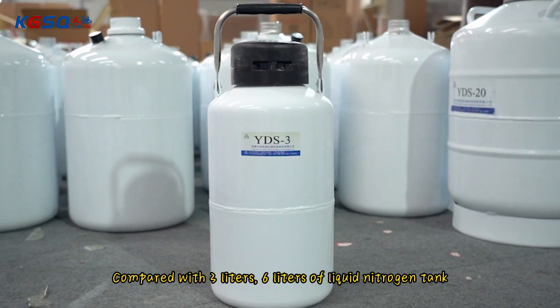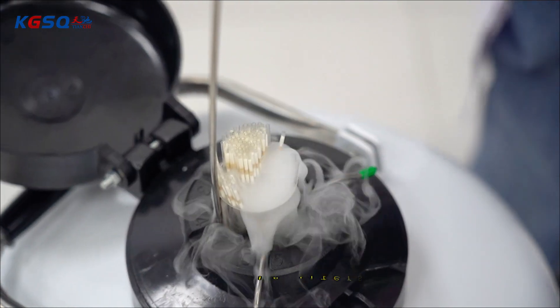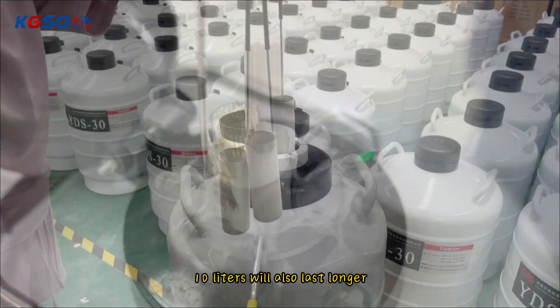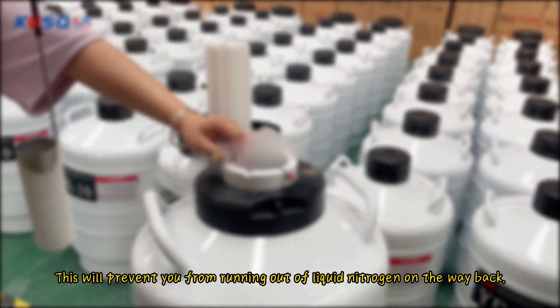Compared with 3L and 6L liquid nitrogen tanks, the 10L will also last longer. This will prevent you from running out of liquid nitrogen on the way back.